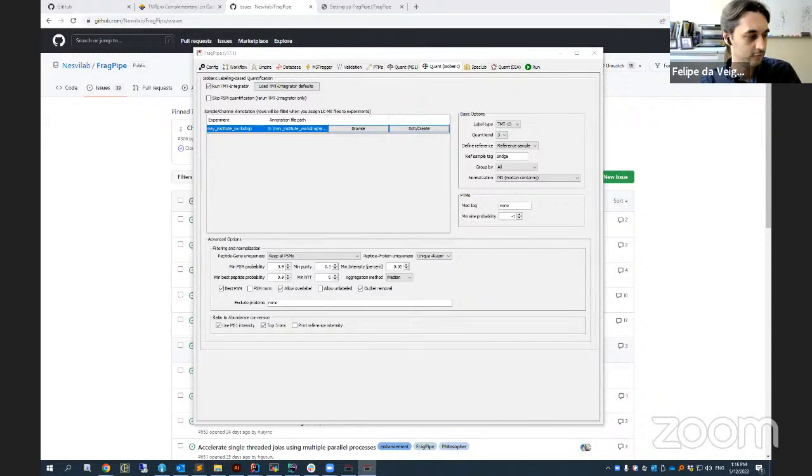So what we suggest is go to the Philosopher website, the GitHub, where we have a tutorial or a description on how to properly format the FASTA headers. We normally ask people to follow some open standards like the NCBI format, the UniProt format, or the Ensembl format. You can have a very simple one that you can create, but you cannot add too many crazy elements to it because it might break the processing. So start by looking at what kind of format you have and check the website to see if the format is good. If it's not, you can always get in touch with us and we can help.